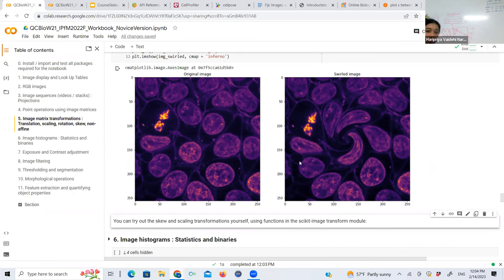We're going to do these topics. We're going to start with image filtering. Filtering is one of the most fundamental things that you can do to images. It's how you clean, how you denoise, how you blur things and smooth the image. And then the second thing, the super cool, fun, interesting stuff: if I have this background and I want to isolate my nuclei, how do I pull out a picture of just the nuclei?